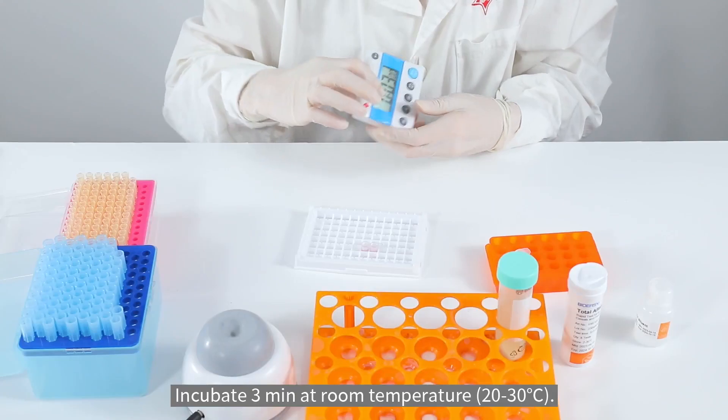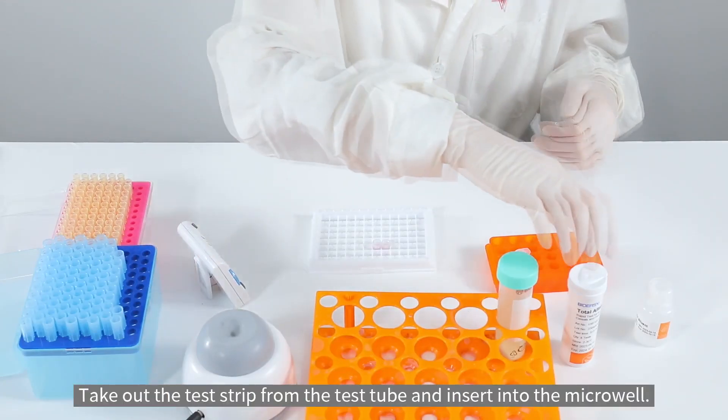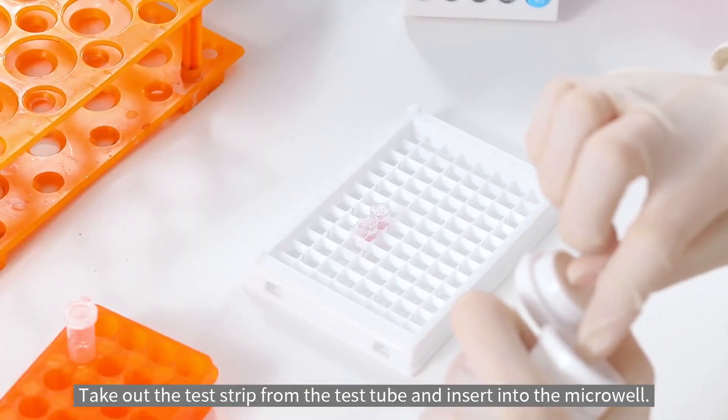Incubate for 3 minutes at room temperature.